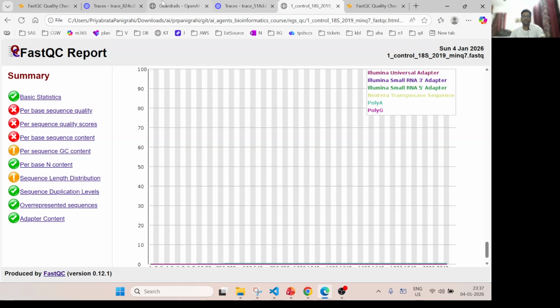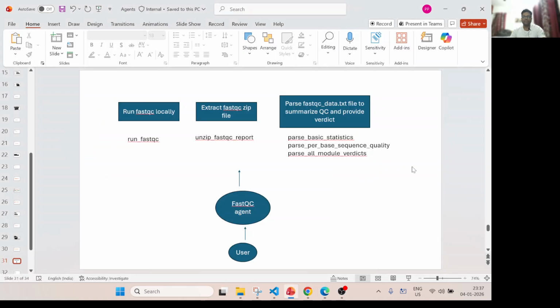tool over here in this one. So that means now Trim Galore, some tool, right, like trimming, and then associate that tool as well. So now the agent will think that, okay, the quality is bad, now let me call that, and you can define the workflow like that. So here, if you look at this design pattern, what we did, we did not define the flow, we gave our agent everything. And we told the agent, you do whatever you want. This is complete autonomy we gave.